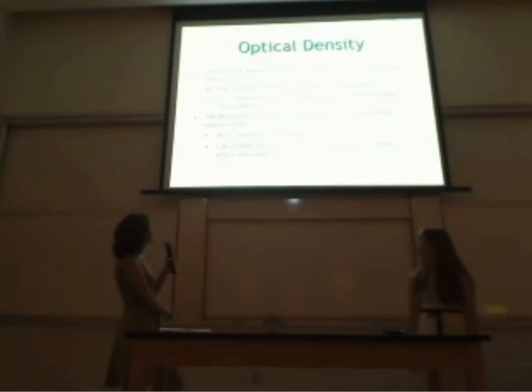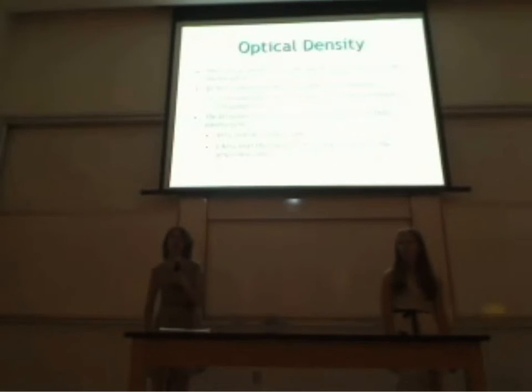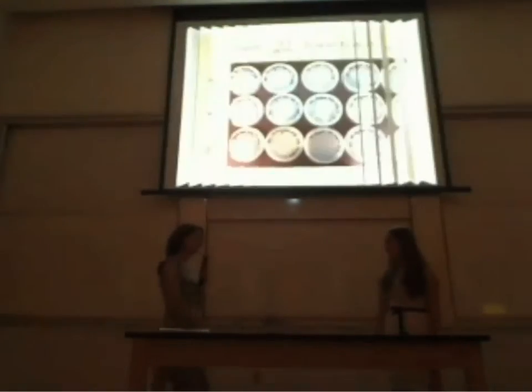At both wavelengths, the M- bacteria was slightly more absorbent, which would actually support our hypothesis that being unmethylated allows more to be ampicillin resistant. But we don't really know if it's significant because we didn't have a big enough sample size. So it could be due to factors other than the methylation of the plasmid as well.